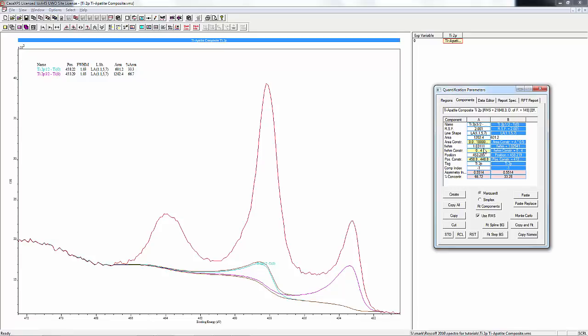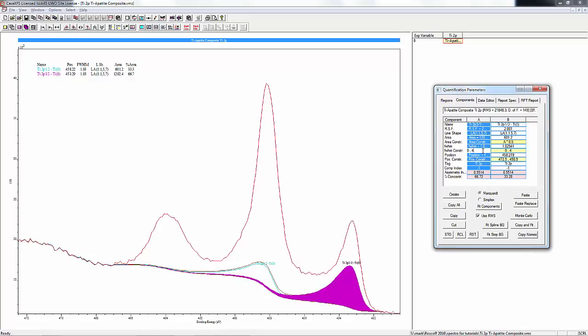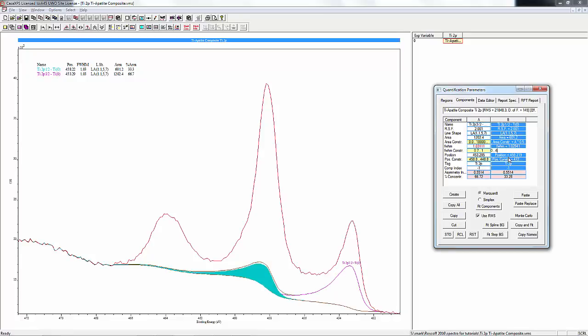The full width half maxes we'll define within a range, so for the 3/2 peak we'll keep it somewhere between 0.7 and, start with say 1 eV for now. The 1/2 peak is generally broader for titanium than the 3/2 peak, and so we'll put that at say 0.75 to 1.1 to start with.